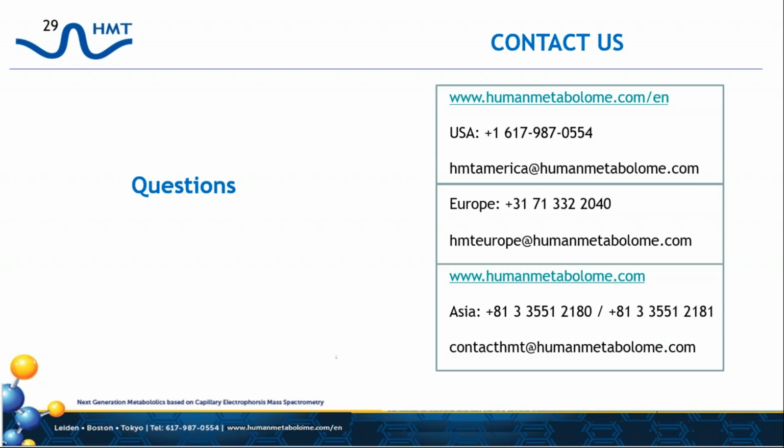You can certainly work with smaller groups for pilot studies to try to get information about differences and depth of analysis. This is something that we would work with each client on in developing the correct work plan that would have sufficient impact. So this is really done on a case-by-case basis. We have no minimum samples, but small sample sizes are generally just used for feasibility studies and small pilot studies.